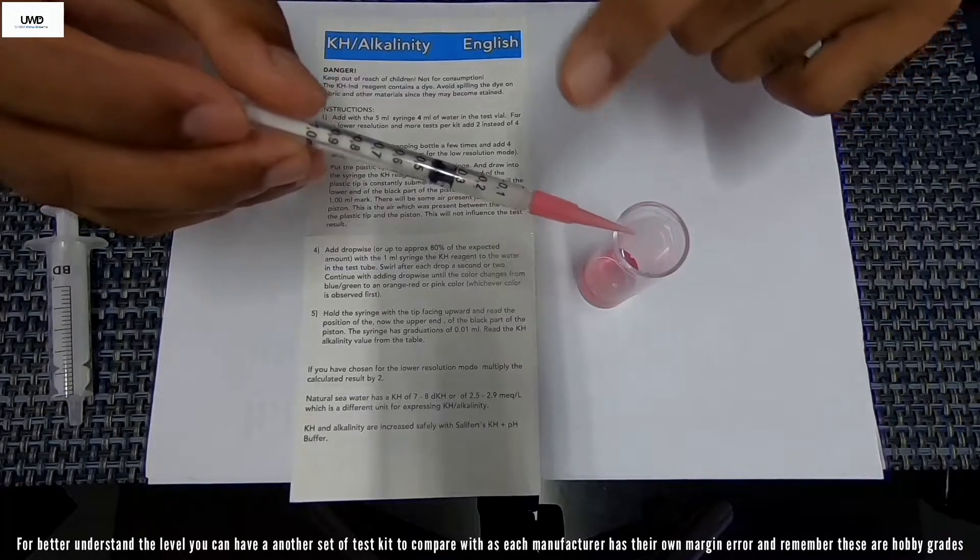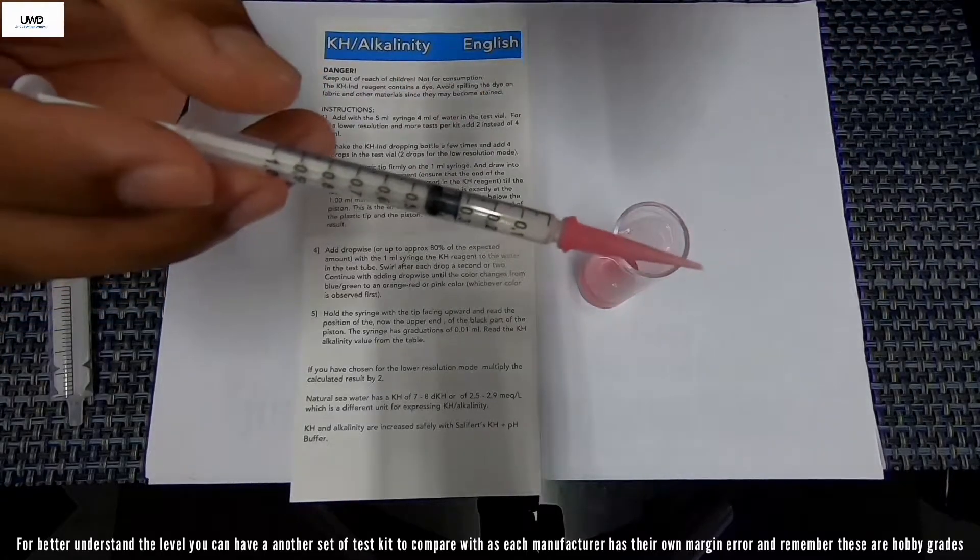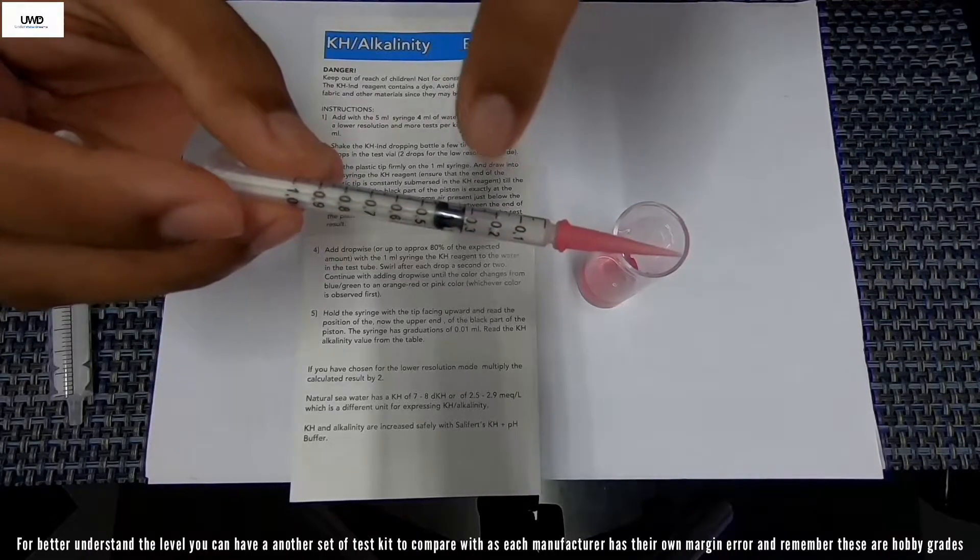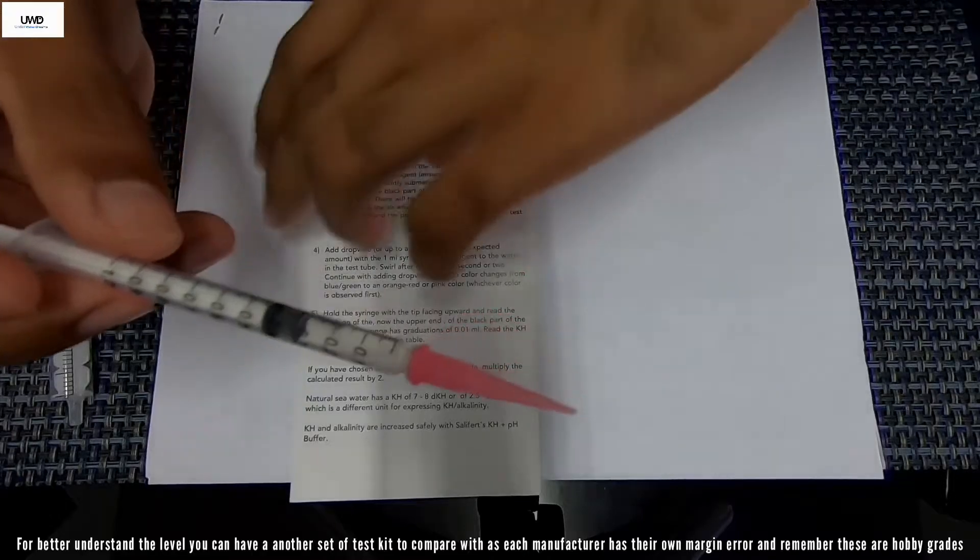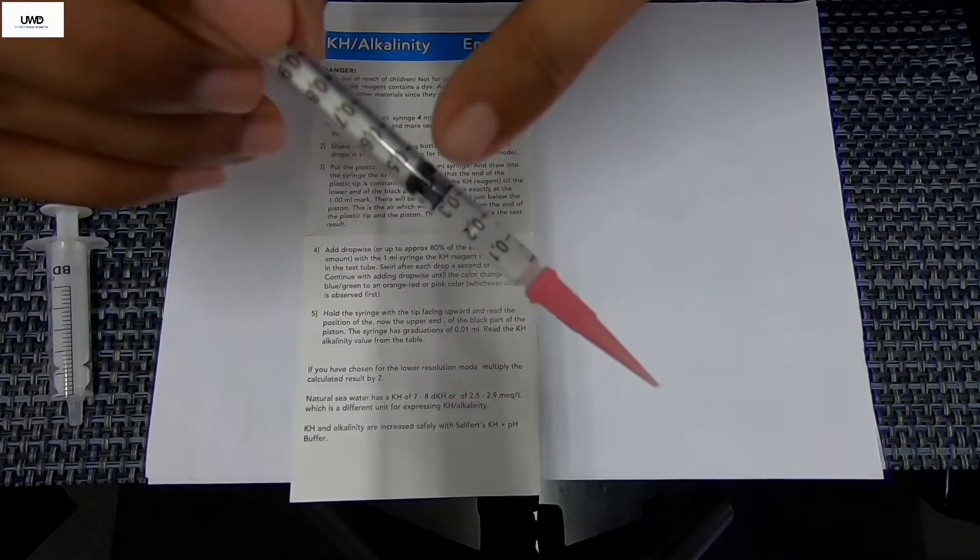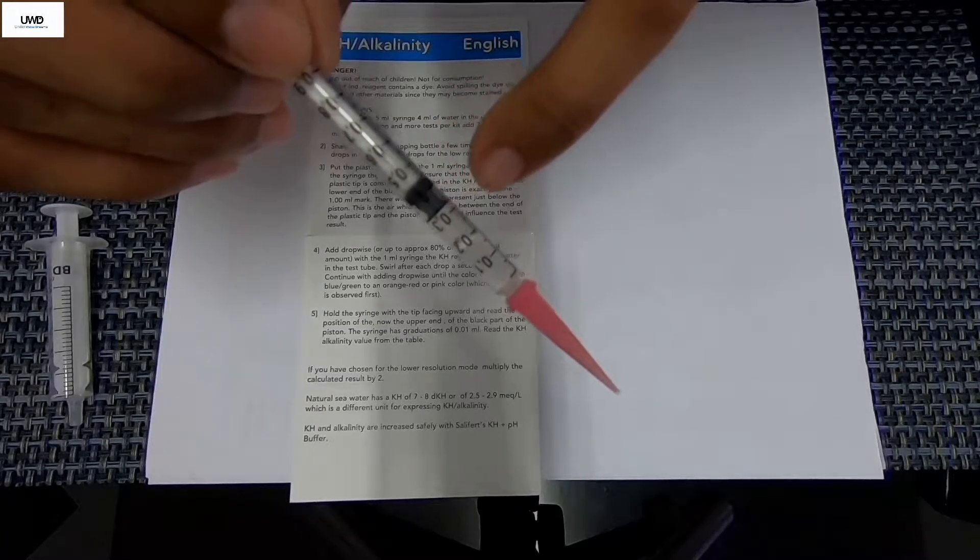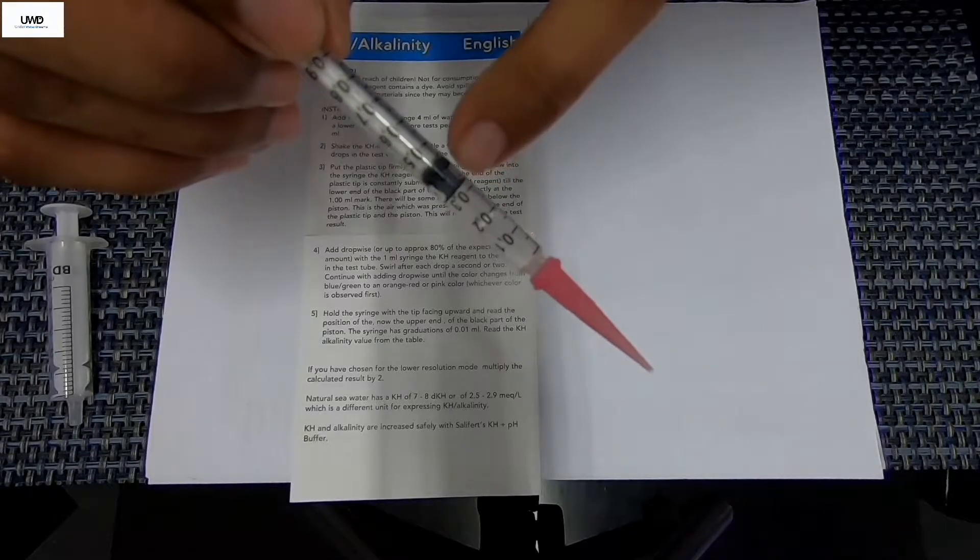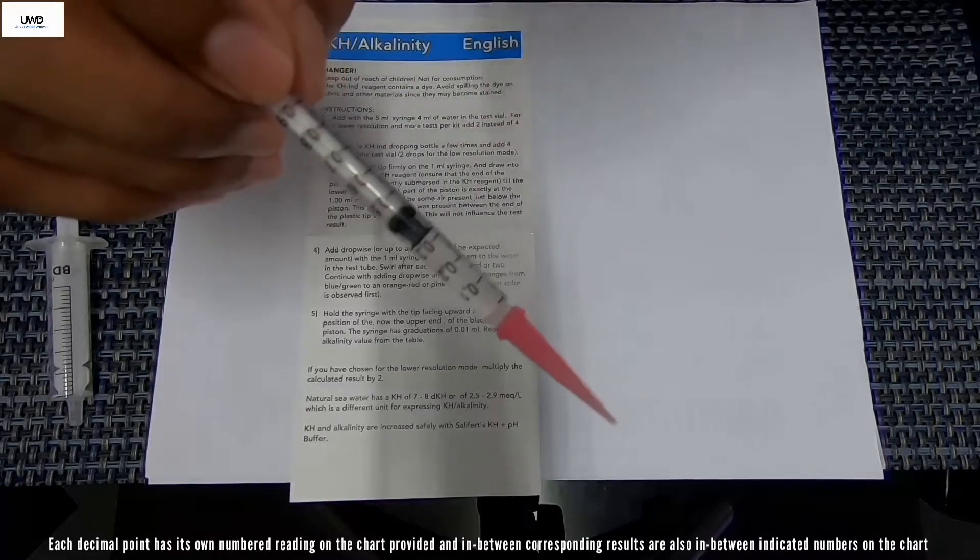You want to get the color of this to this nozzle color, pink color or same color matching. Now we're going to be reading this indicator and how much we have used and what we have got in the level. You're going to read the main measurements from the end of plunger. Remember I told you, this is the plunger reading. There's about 0.3, 3.2, 3.4.